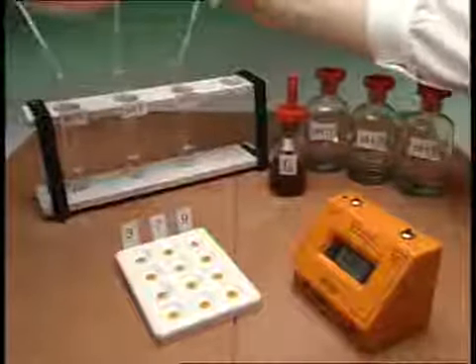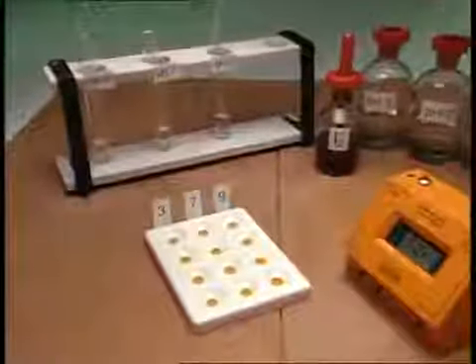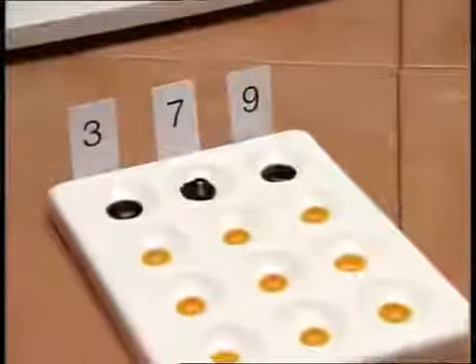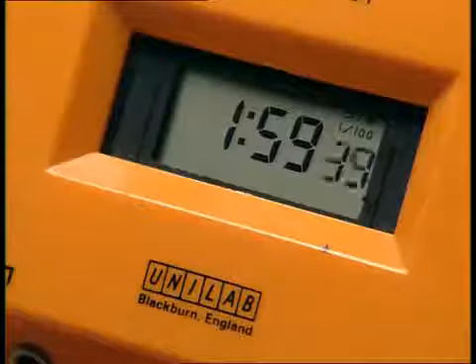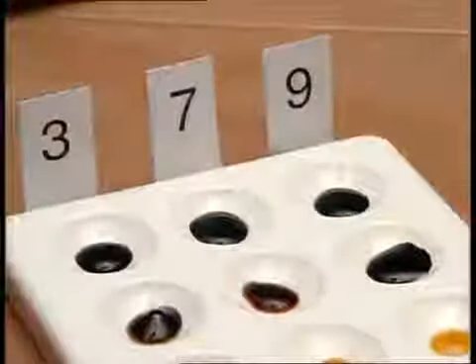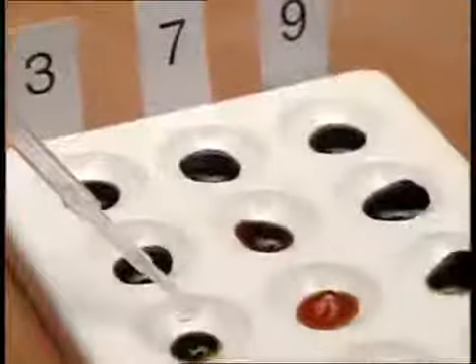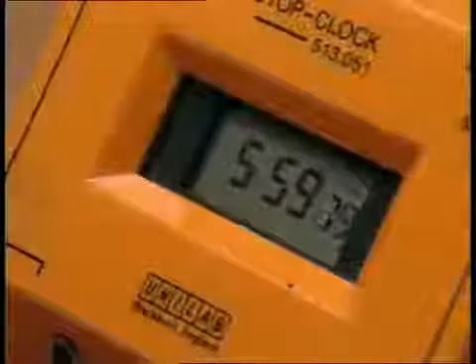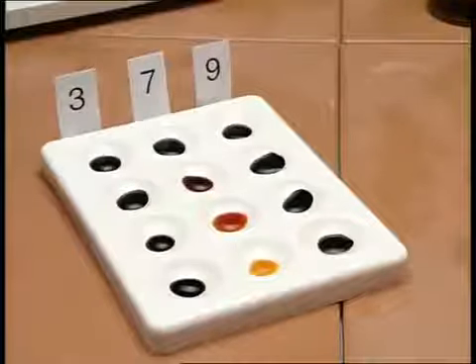Now, the same amount of salivary amylase is placed in each, and immediately a sample of each is tested with iodine to monitor the reaction. The iodine turns blue-black because starch is still present. Every 2 minutes, a drop from each test tube is added to the iodine. If the starch has been digested, the iodine will not change colour. Finally, 6 minutes into the experiment, at which pH does the amylase appear to work best?